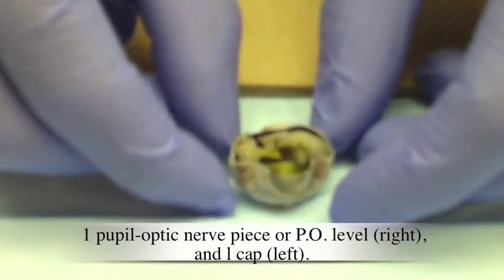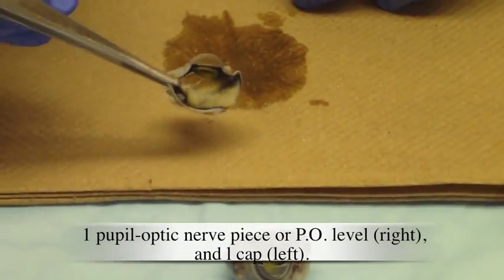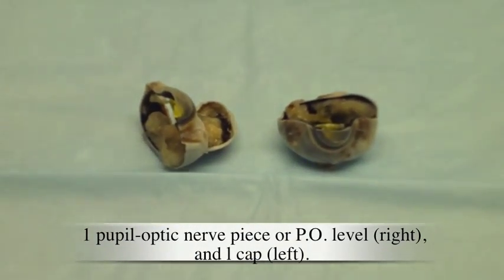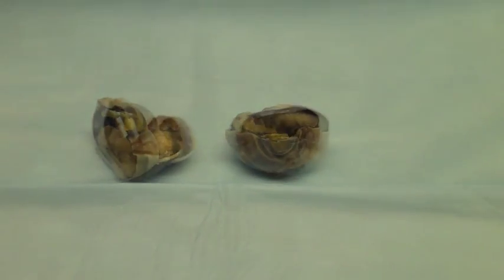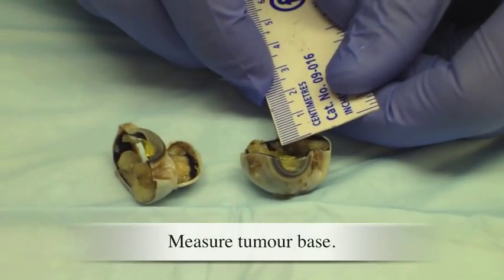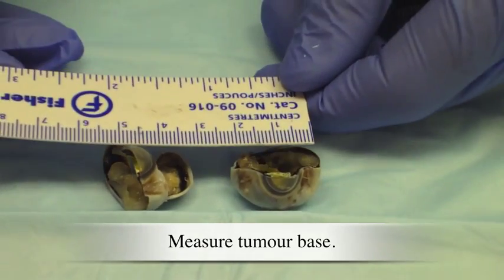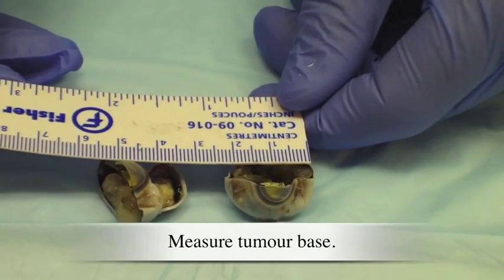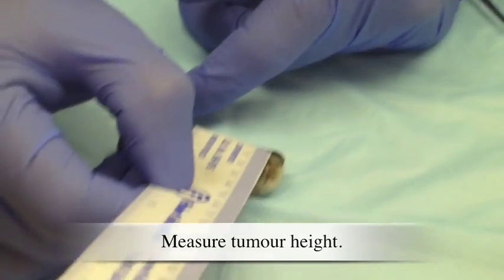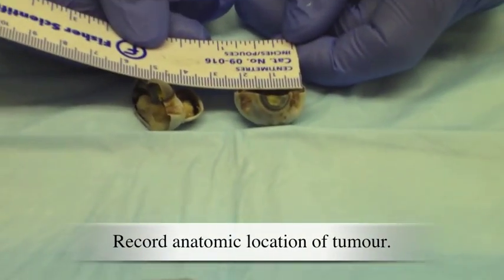The eye is now in two pieces with the tumor exposed: one pupil-optic nerve piece, or PO level, on the right, and one cap on the left. Estimate tumor size, measure tumor base, measure tumor height, and record the anatomic location of the tumor.